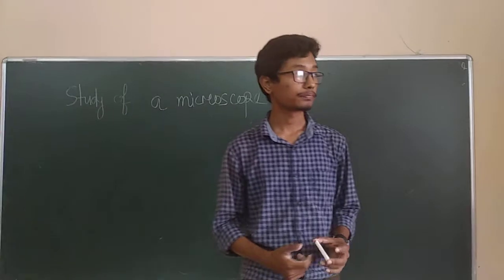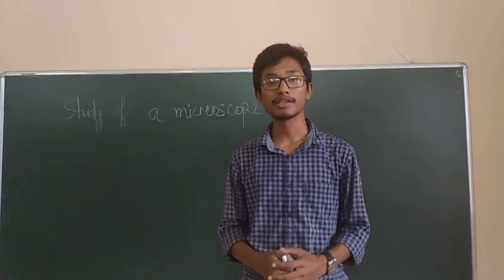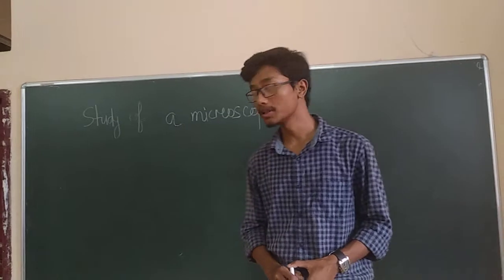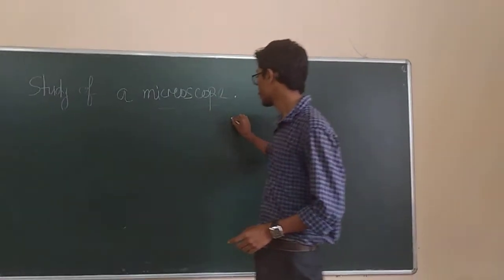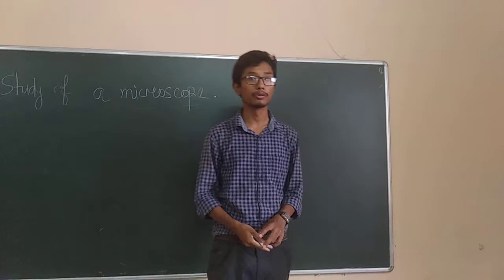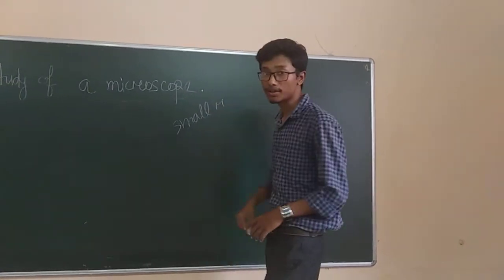Today, in this video, I am going to talk about another practical video of pharmaceutical microbiology from third semester. So, the aim of today's experiment is study of a microscope. So, what is a microscope? Microscope is an instrument by which we can observe smaller objects.